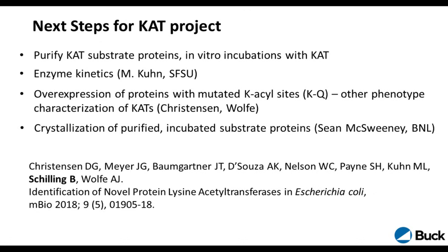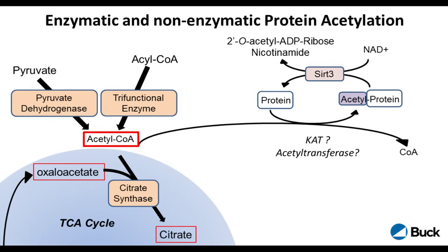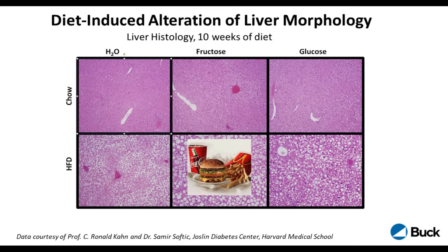So, I hope I could show you in this E. coli project how we used affinity enrichment together with the DIA, data-independent acquisition, as a very efficient way to deeply mine the acylome in these bacteria. As a second part, I'd love to show you some data that we did in mice. These antibodies also work really well in mice. So we have acetyl-CoA, and you can now imagine using this acetyl-CoA to either chemically acetylate or also use acetyltransferases in these mammalian systems.